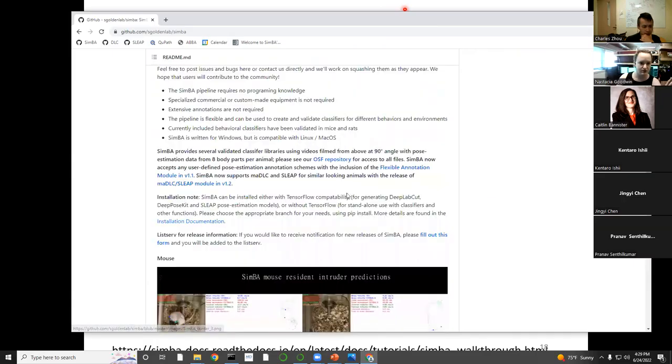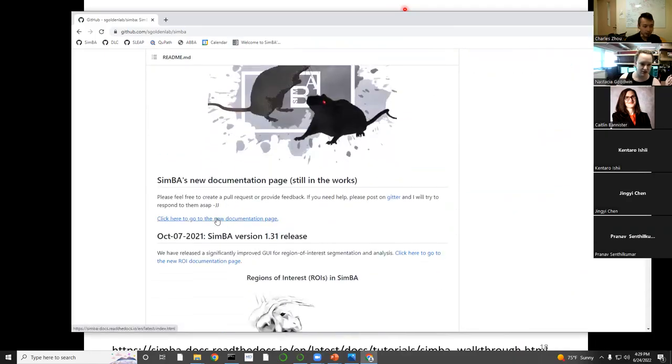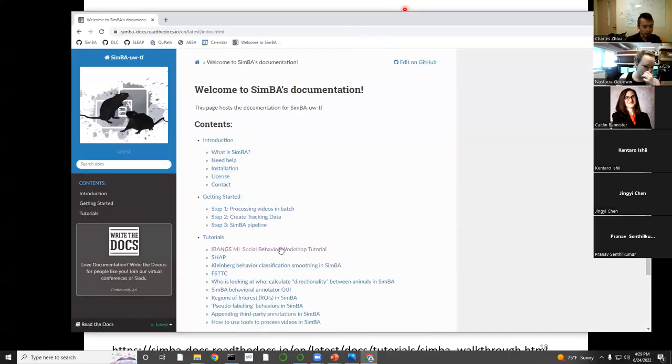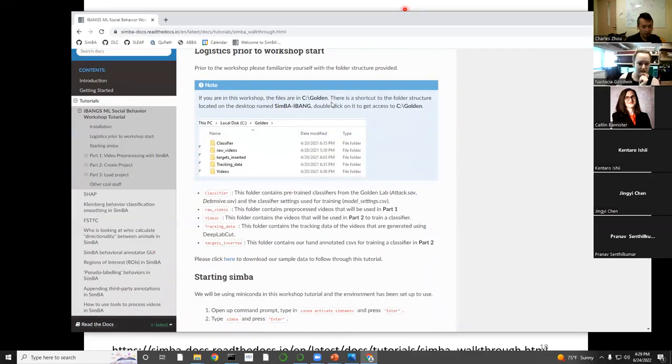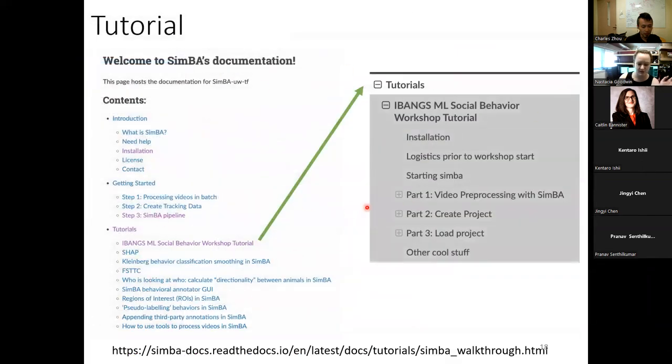If you go to our new documentation page, which is down here, we actually did a full tutorial for a conference pretty recently. This workshop tutorial has a little data set to play with, and you can learn how to annotate behaviors in SimBA, and there's some video information too. Since all of that is available, I'm not going to go through it button by button until the end, if we have time and people want. I'm going to talk conceptually about how to make good classifiers and how to arrange things.